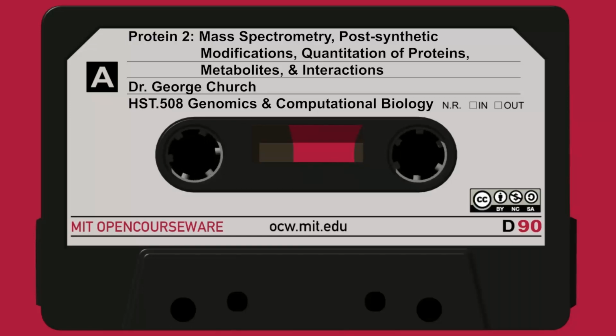And protein mass is calibratable with knowns. Even if you have a very complex empirical relationship, such as detergent binding in SDS gel electrophoresis, it sounds like too many moving parts to be completely theoretical. But if you calibrate it with good known proteins or protein complexes, if you're doing a native electrophoresis or native sedimentation velocity, then you can get a curve where you can interpolate and find masses quite accurately, or at least within about 2%.